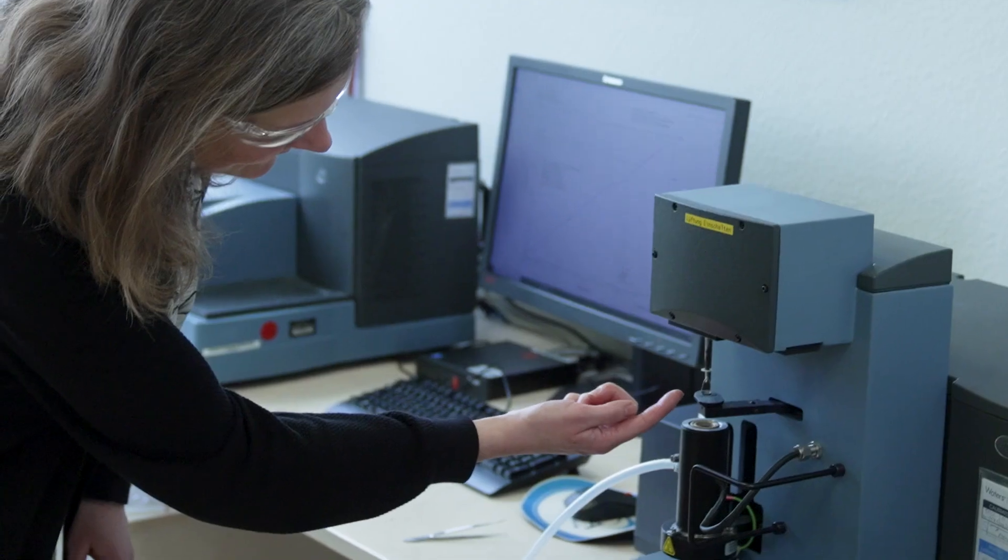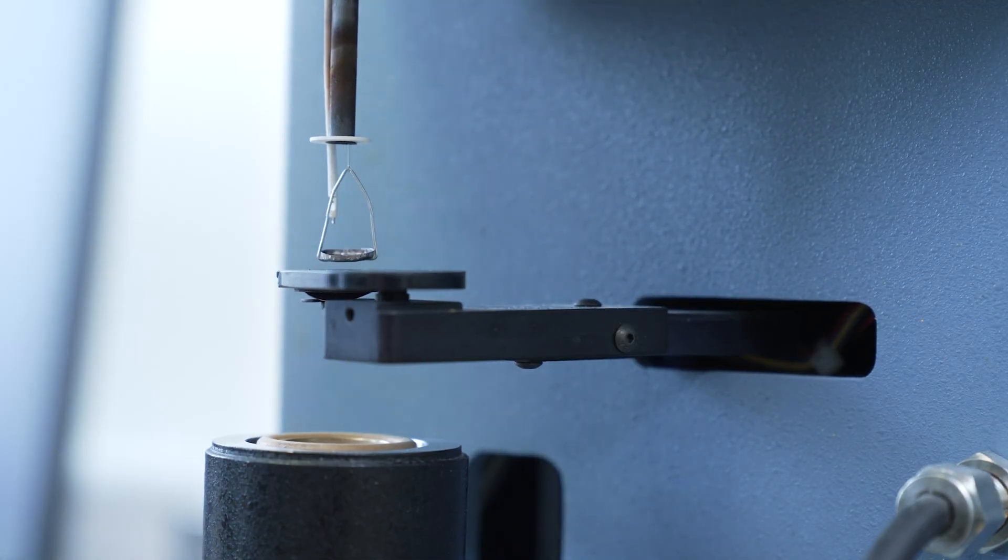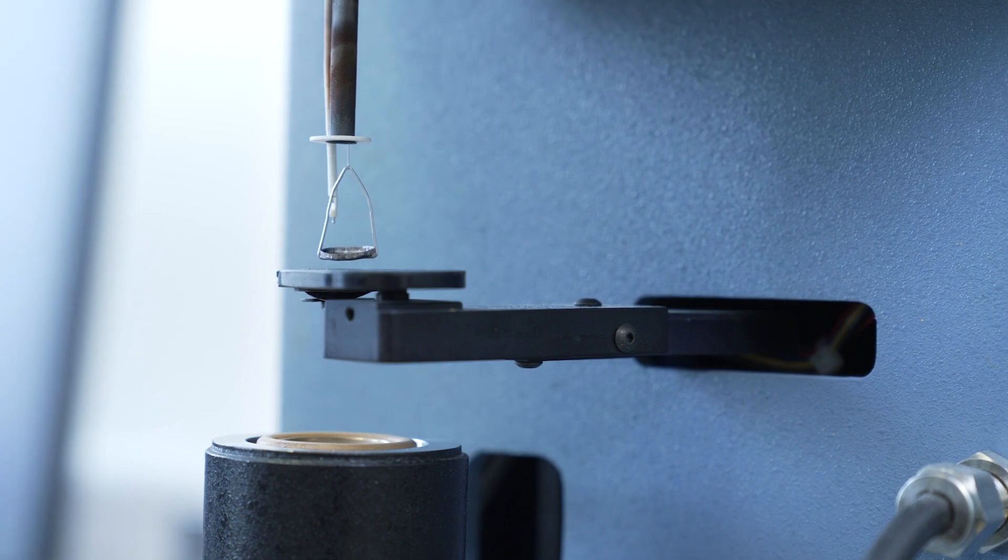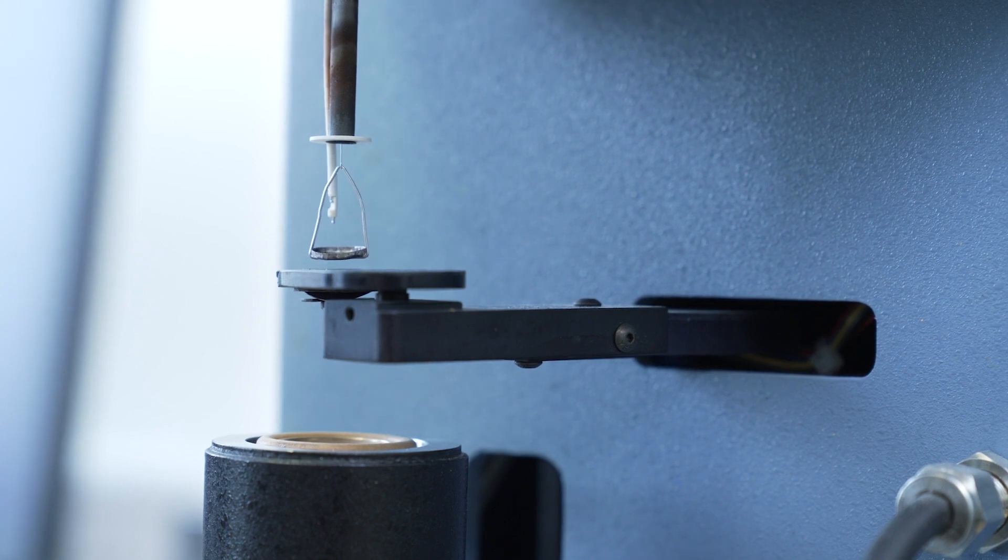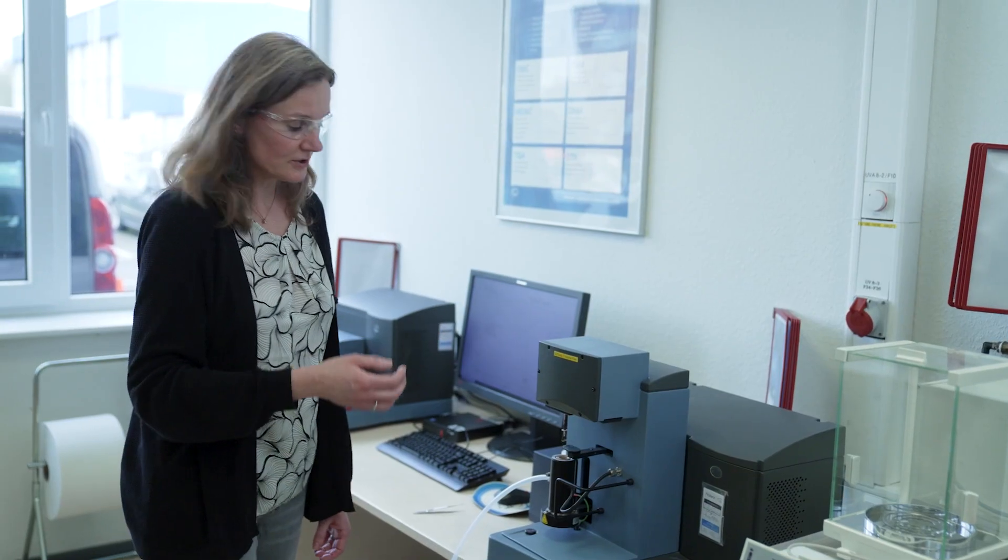Then this very delicate hook drags it up, and this is where the weighing of the sample happens. So now you determine how much your sample weighs at room temperature.